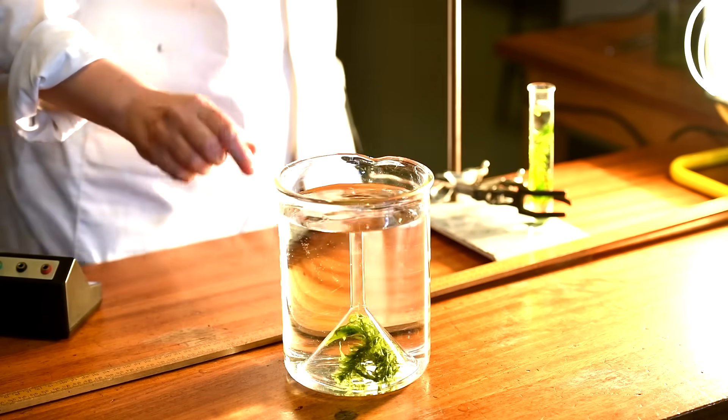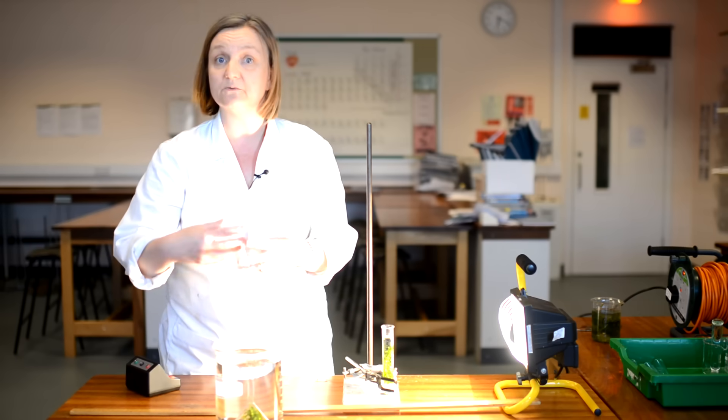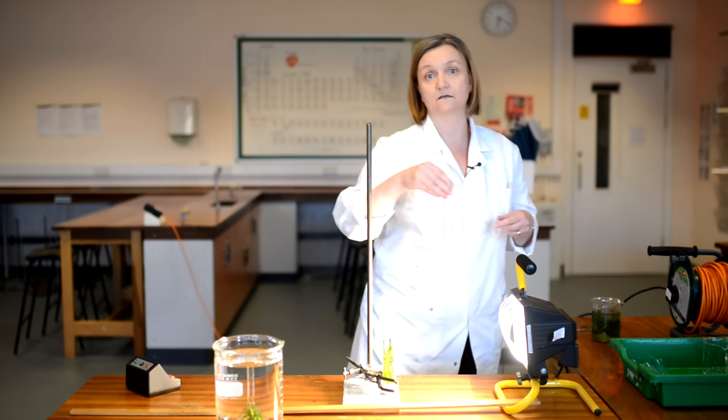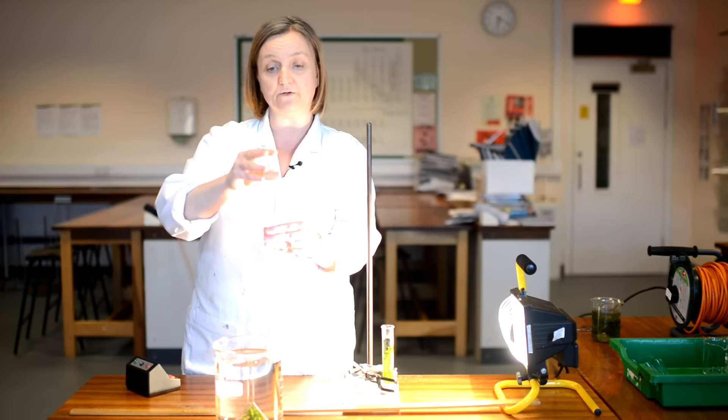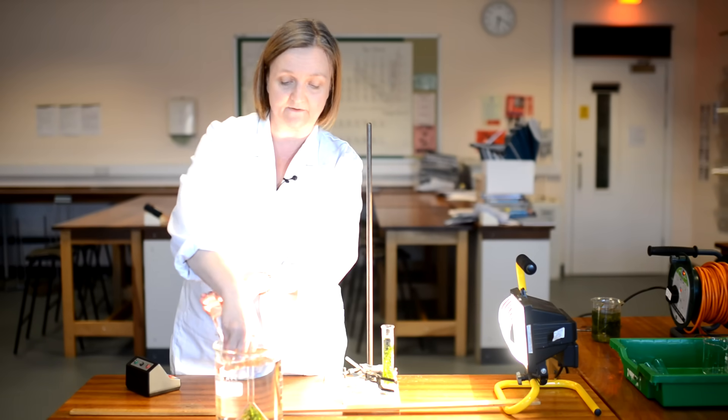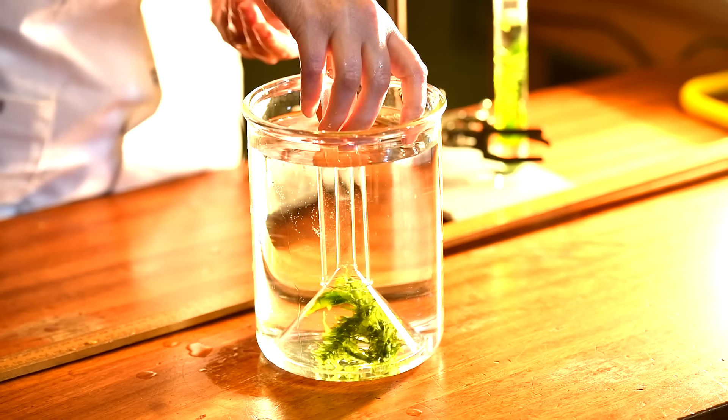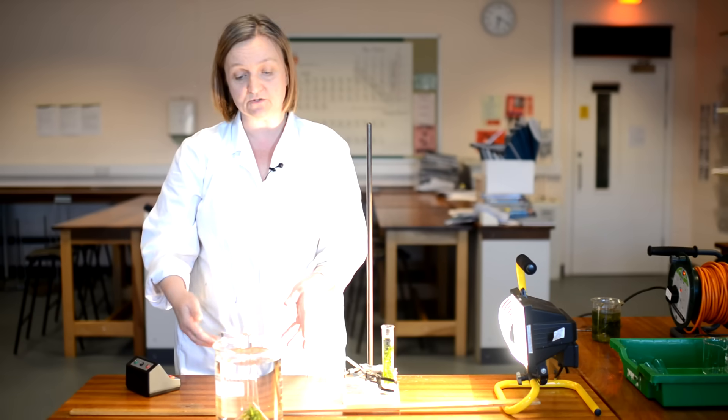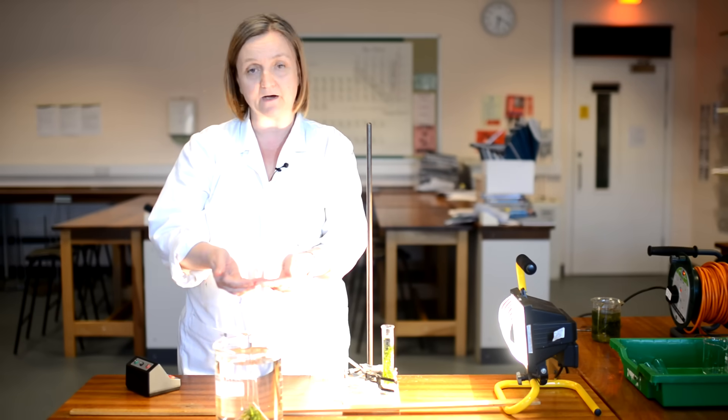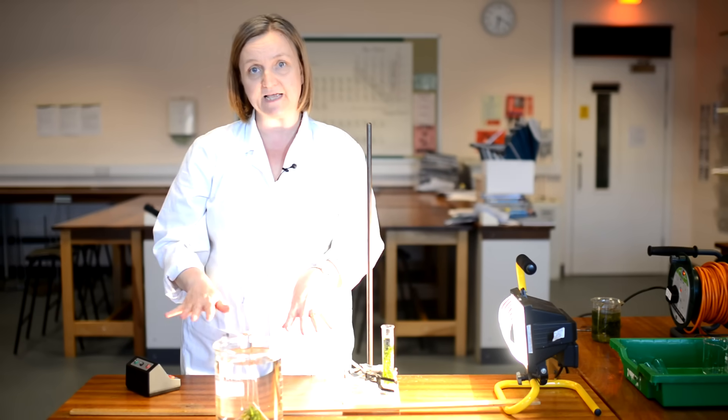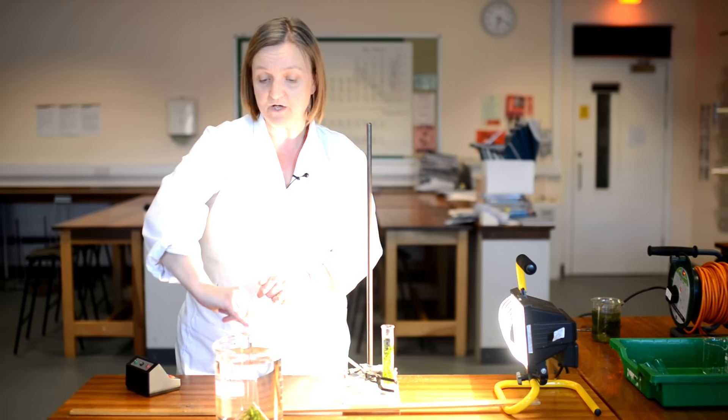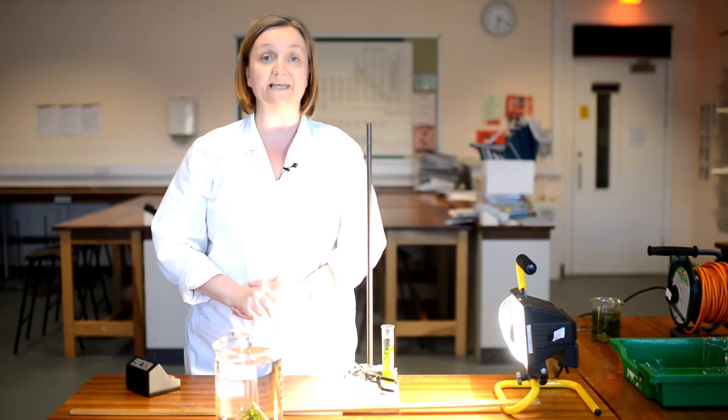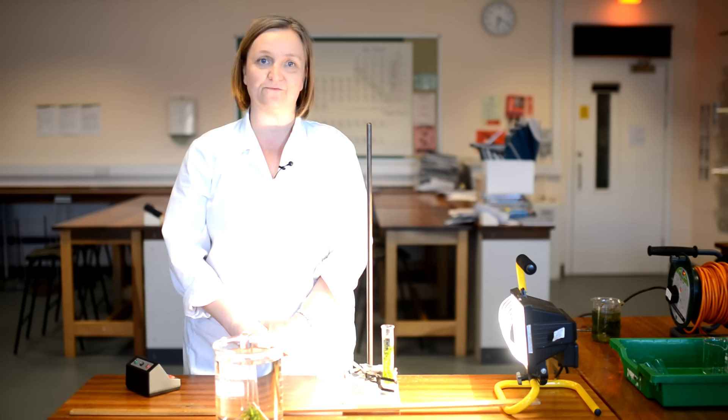Now, obviously, again, with the light source close by, the pond weed will start to photosynthesize. But to collect the oxygen, I need to take a boiling tube full of water, turn it upside down and place that over the top of my funnel. And now, as the bubbles of oxygen are produced, rather than just disappearing into the air, they will pass into the boiling tube, displace the water, and then after a few hours you should have collected enough oxygen that you can either measure its volume or you can test with a glowing splint, which should relight to prove that it's oxygen.